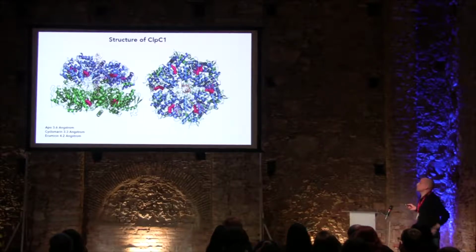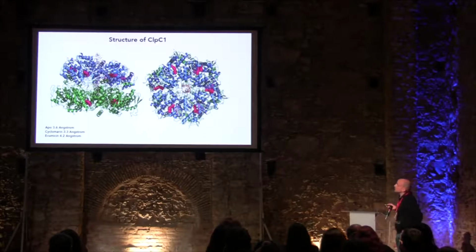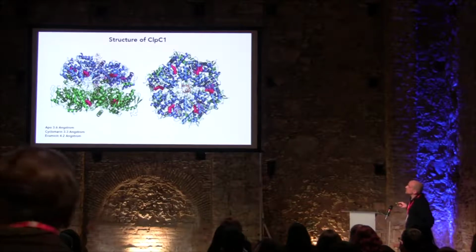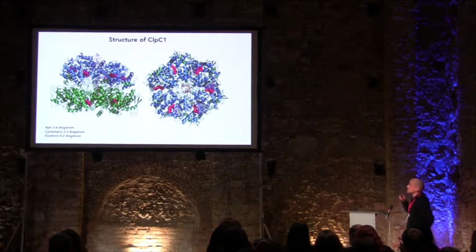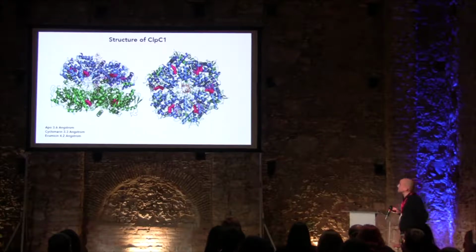You see the D1, D2, you see the nucleotides bound, you see 6 nucleotides in the D1 ring, 4 in the D2, and spectacularly you also see a full peptide. This was unexpected, but it was already reported in the literature for proteins of the same family. You also see the tyrosines of the binding loops surrounding these peptides. So this is basically a snapshot of our machine working. Okay? Sadly, we don't see the NTDs.